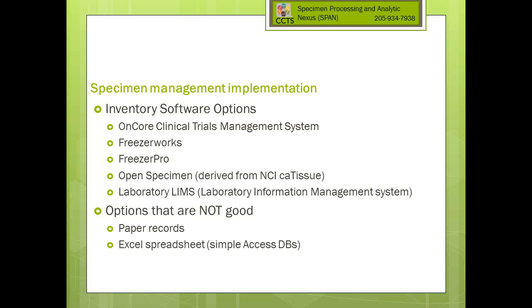And that's true even in these commercial off-the-shelf systems, right? Once you get information in there, if you pull a sample out of your freezer, you've got to make sure you log it out. Because if the system says it's still in your freezer and it's not there anymore, then you have a problem. But that's particularly problematic in Excel or homegrown applications, where it's really difficult to build in the kind of give and take that you need for samples going in and out and tracking where they are.